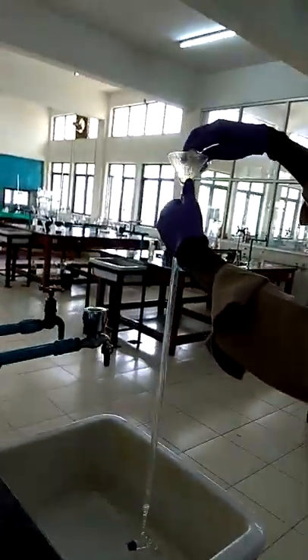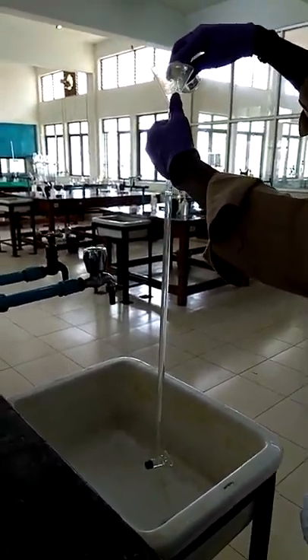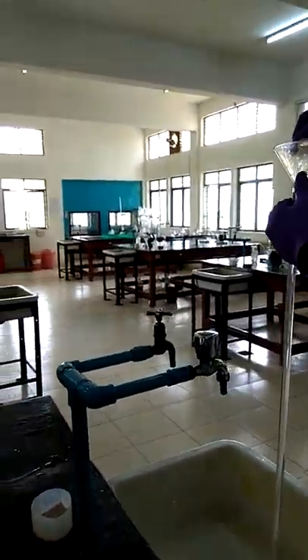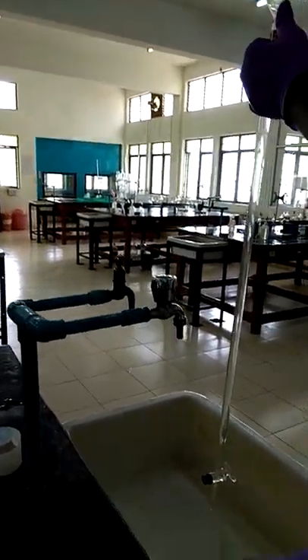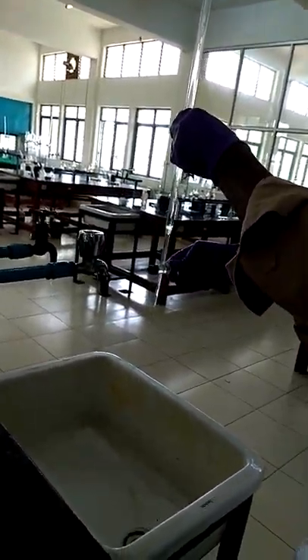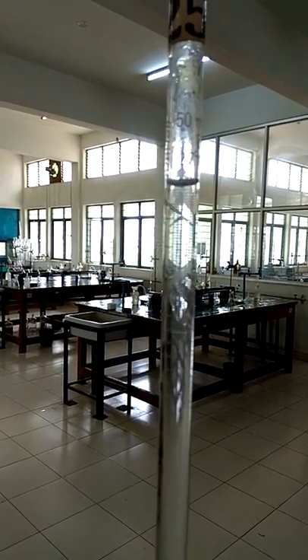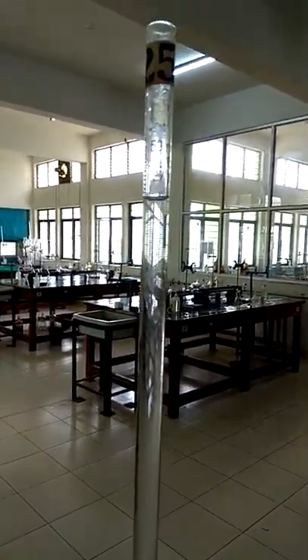Then fill the burette with EDTA solution. Take it above zero and adjust to zero later. First, remove the air gap in the bottom by opening and removing some solution, then you adjust the lower meniscus to zero. So this is the standard EDTA solution. Then fix it in a burette stand, close it, and keep it back on the glass door.